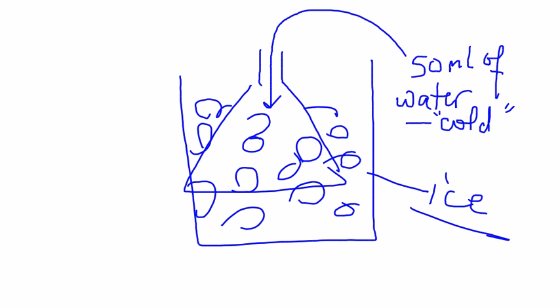The reason we want it cold is because, recall, we had added a catalytic amount of acid, and we are trying to essentially get an ester. But if we don't pay attention, we might actually hydrolyze our ester back. So we don't want that to happen. We want to try to keep it as cold as possible.